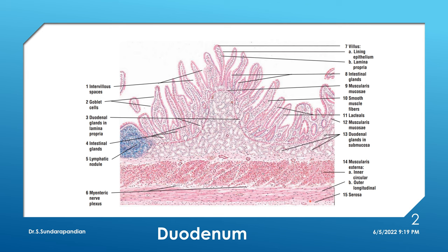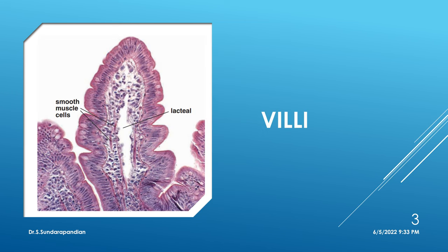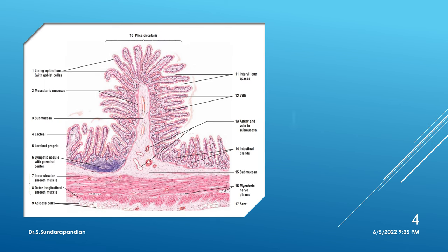To identify the slide of duodenum: see for the basic four layers, then see for the villi, then concentrate on submucosa — it will have Brunner's glands. In the lamina propria of the villi you can make out blood vessels and lymph vessels. The lymph vessel present in the villi is called a lacteal.